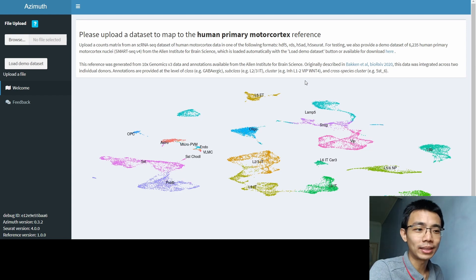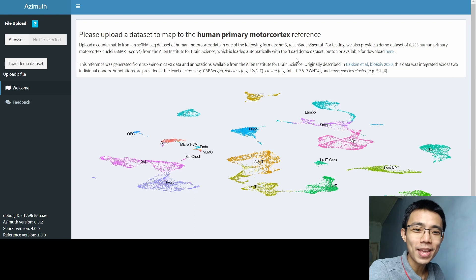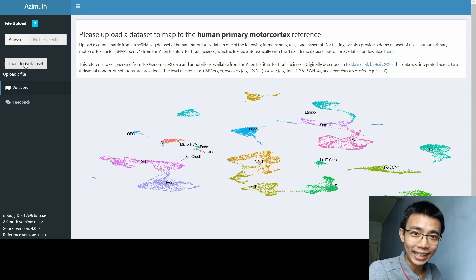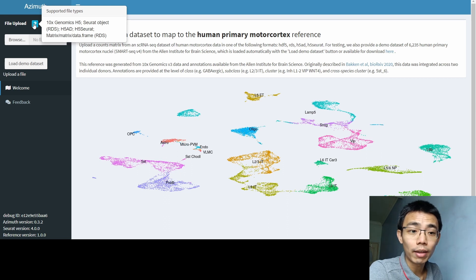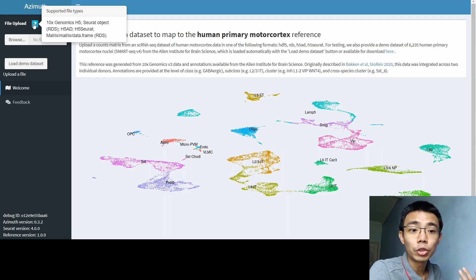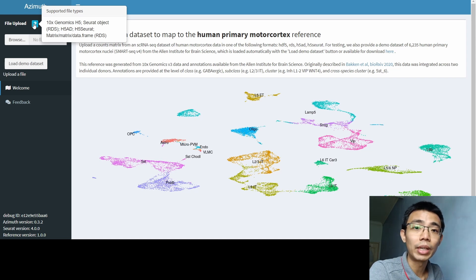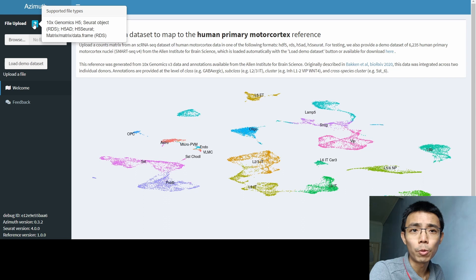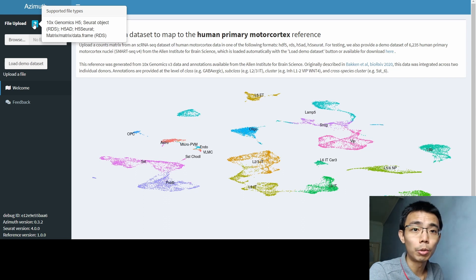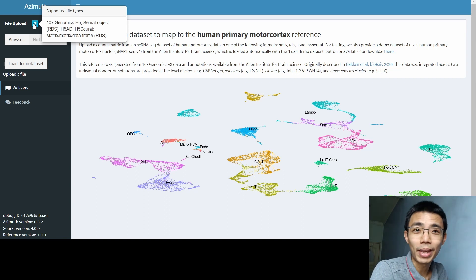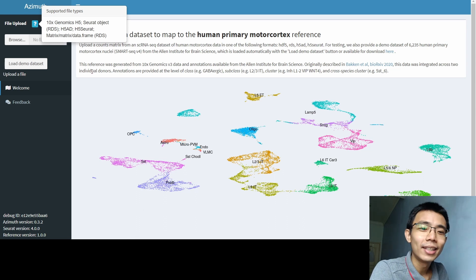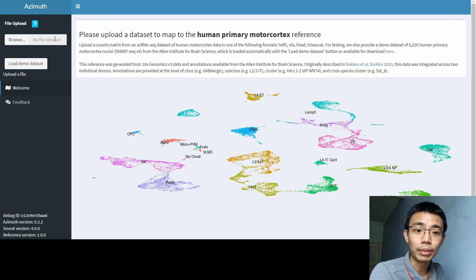So how Azimuth works is there's not much you can do at this moment, but you can just upload your own file or load a demo dataset. So for uploading, you can choose between 10x Genome H5, Seurat object as RDS, H5AD, H5Seurat, or matrix data frame as RDS object. All of them work, but uploading a Seurat will be the most confirmed that it will work. So I'll recommend you to upload a Seurat object if you can. Just choose your object and I'm going to show you how to create them later.